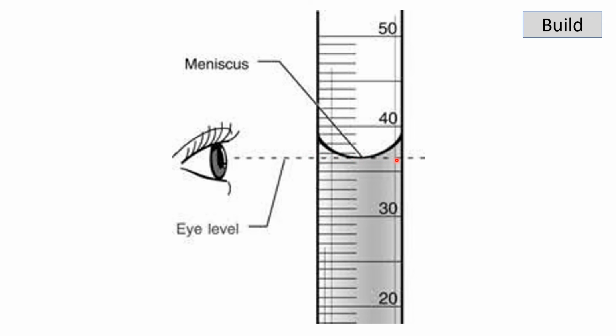And if you all do that, then your results are accurate every time, because obviously there's quite a lot of difference between that point there and that point there, and that's not very precise if you're using that one up there sometimes and that one down there other times. So always use the meniscus line. You have to get down to eye level, and that makes it accurate because you're doing that, and it's precise because I'm using intervals of only 1 centimetre each time.